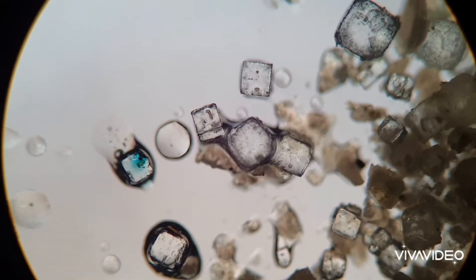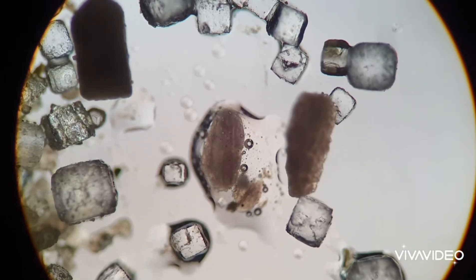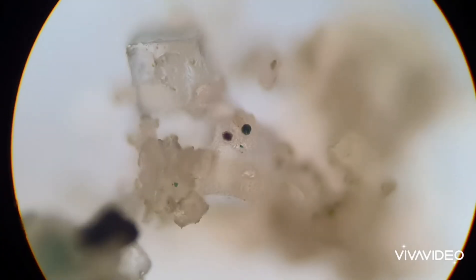I put some of the packaged mix of the eggs under the microscope, and I think it's really incredible — it's a very smart design. The sea monkey eggs are mixed with what appears to be a salt.